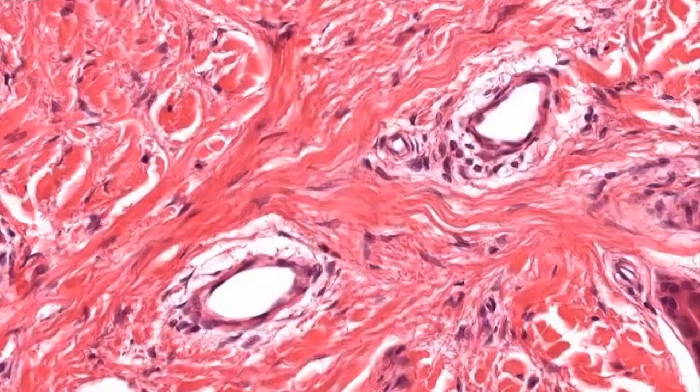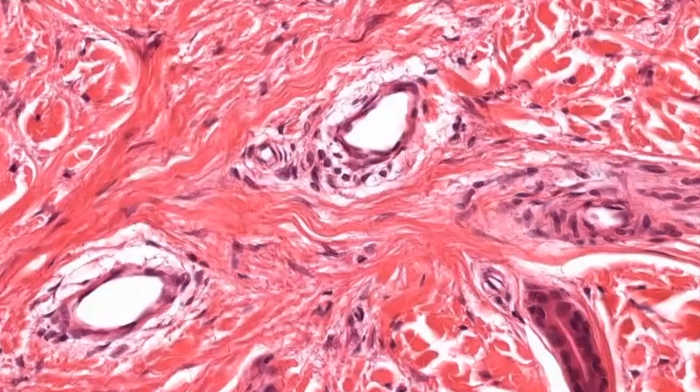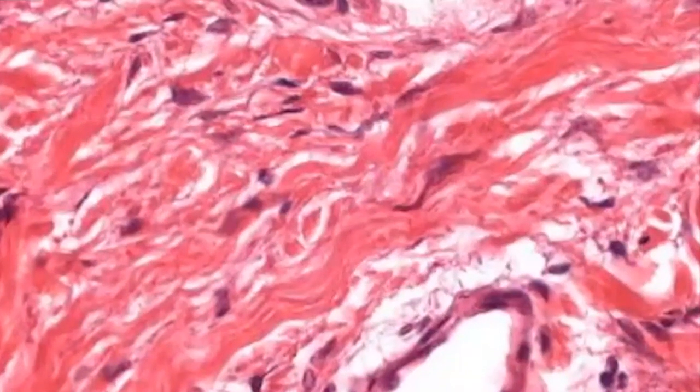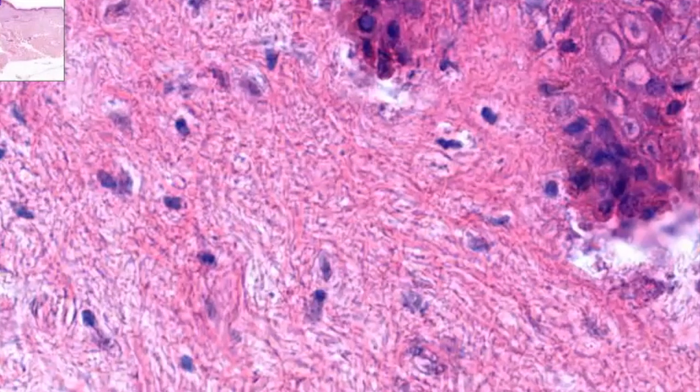These are all like blood vessels. These are like hair cells and stuff like that. So there's a bunch of junk going on here. But if I ask you what fiber these are, you're going to say what? Collagen. You only have two choices, elastin or collagen, unless you're looking at reticular tissue.